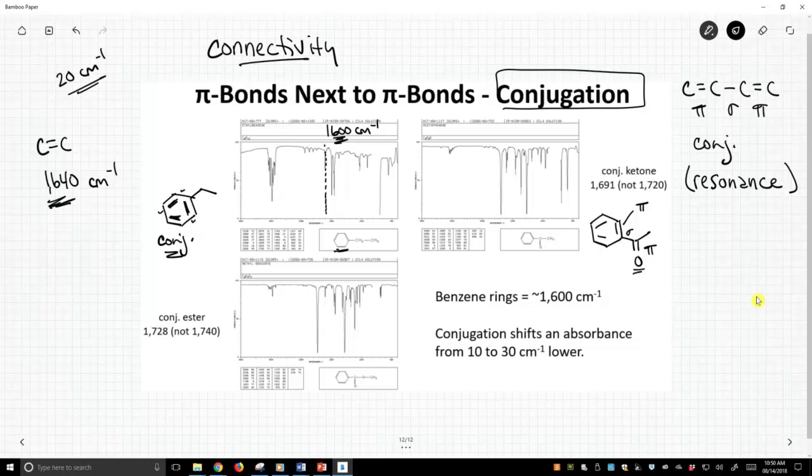We learn ketones normally show up at 1720 in an earlier video. Where is this ketone? It's at 1691. There it is, nice and big and strong, just like a ketone should be, but it's actually below 1720.